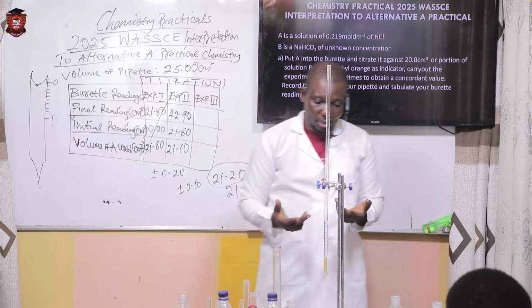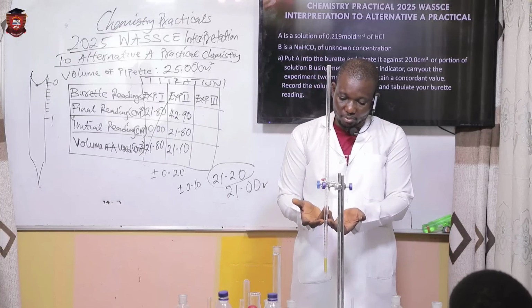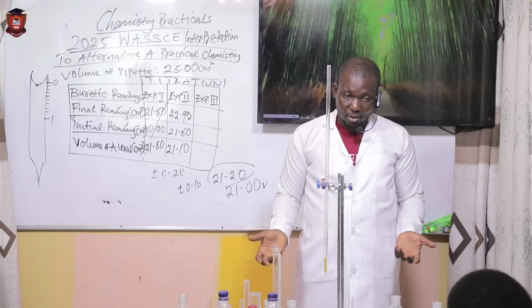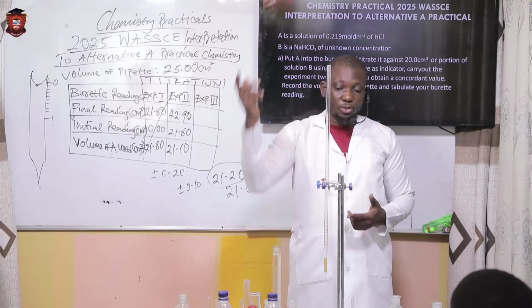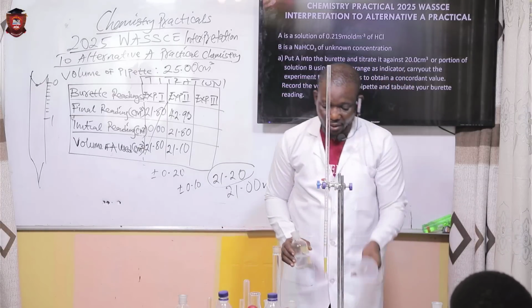Now, I know it can be possible for us to use this again, because you can exhaust this without the reaction being complete. You can't continue the reaction from this. So what do you do? You refill. This is where you refill this point. You must refill it.